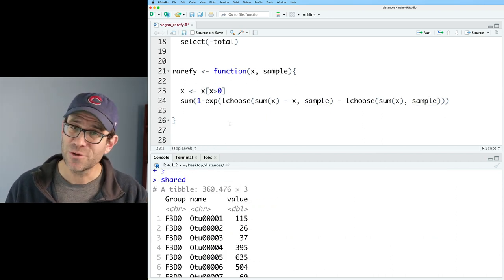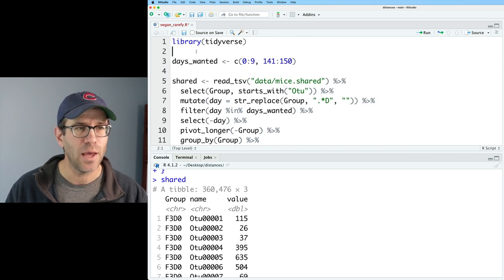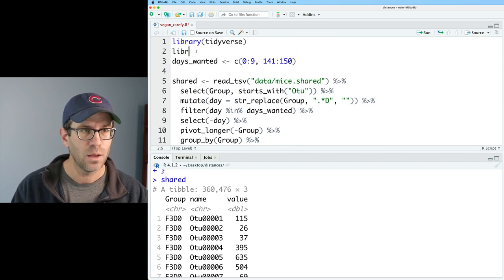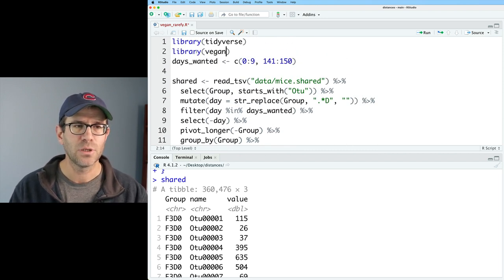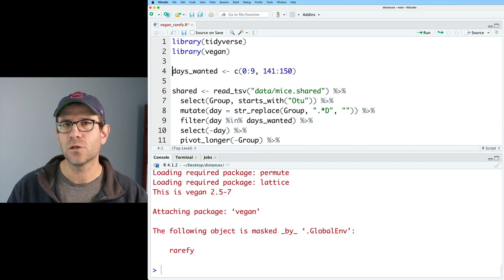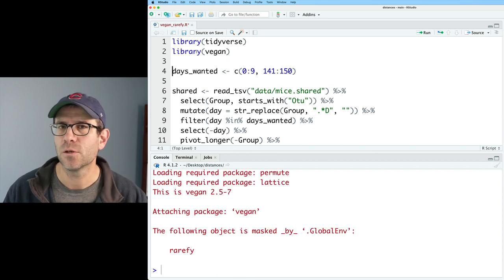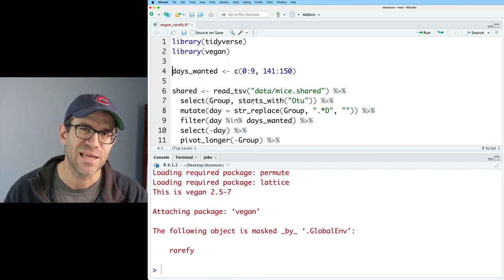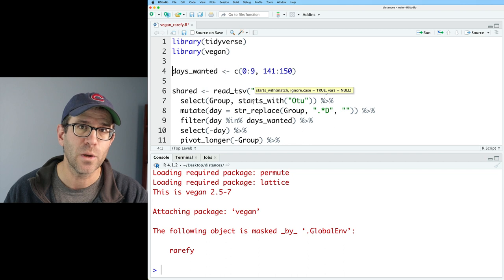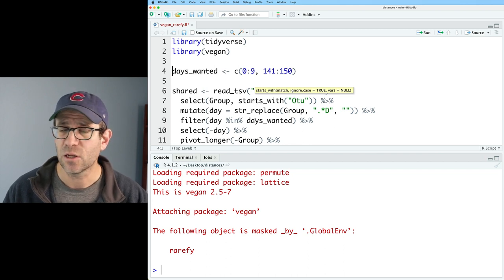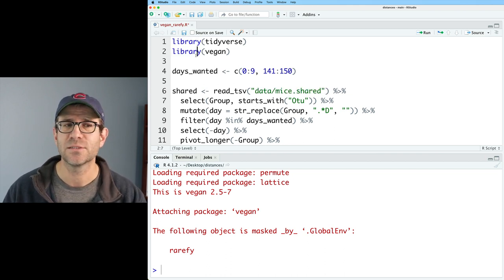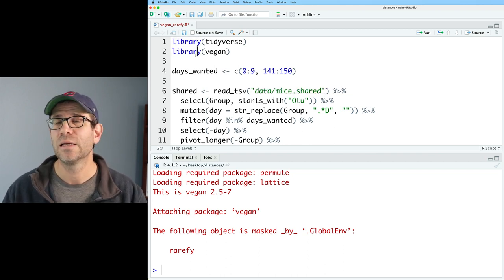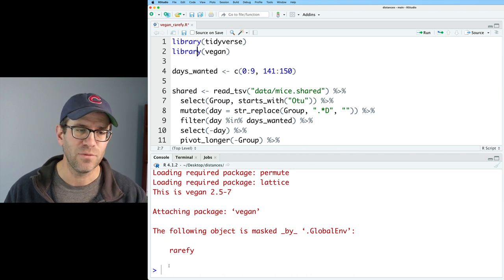As I mentioned, we're going to do a lot with vegan today. So I need to go ahead and load the vegan package. And if you don't have it installed, be sure that you go over to the packages tab in the lower right window of RStudio and install vegan. And then we have access to all the great vegan functions by using library vegan.